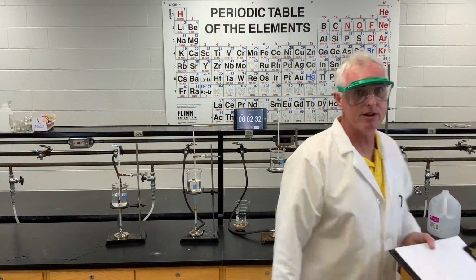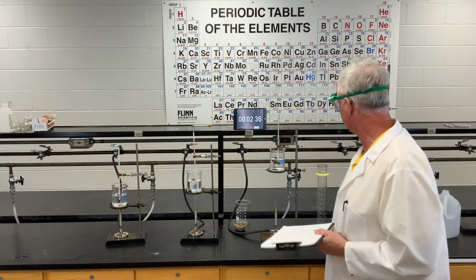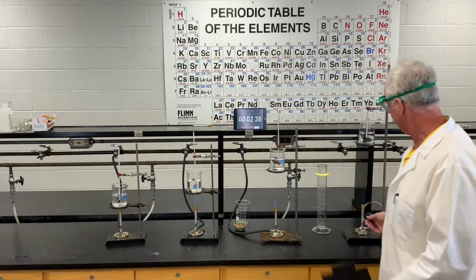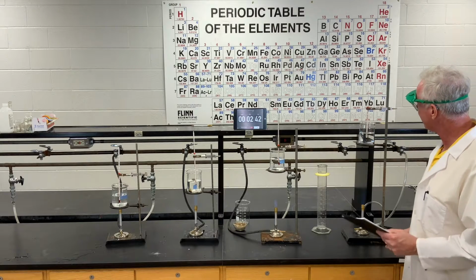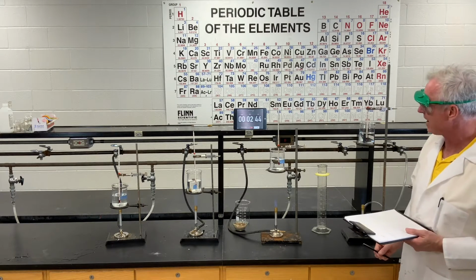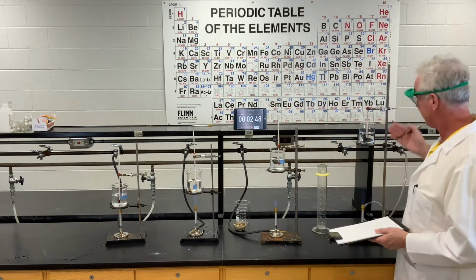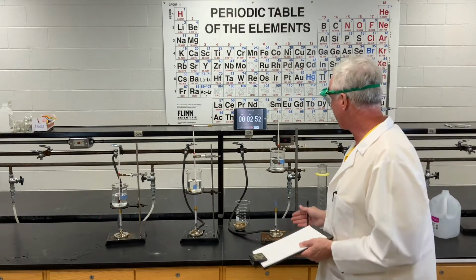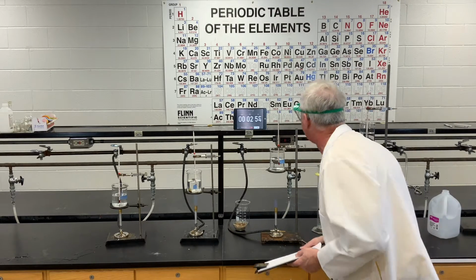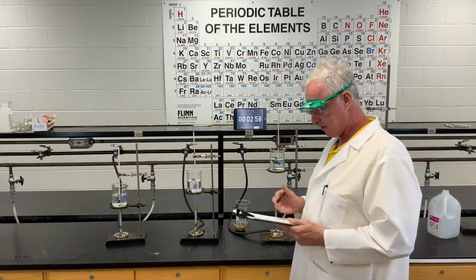I'm 2.5 minutes in, and we've already got a pretty clear view of which one is the worst. If you have it too far away from the heat, this has gone up to a total of 26 degrees after 2 minutes and 45 seconds. So, not a very efficient setup. This setup, top of the blue flame, we're at almost 3 minutes, and we are at just 30 degrees here.